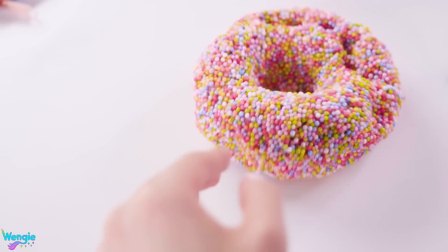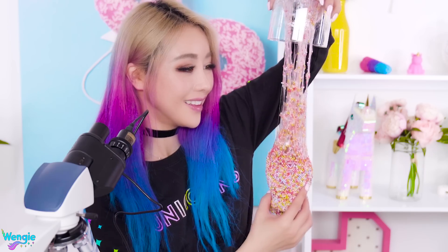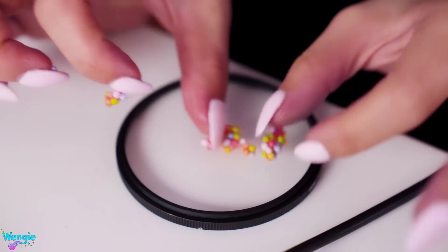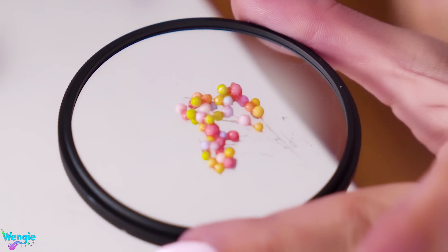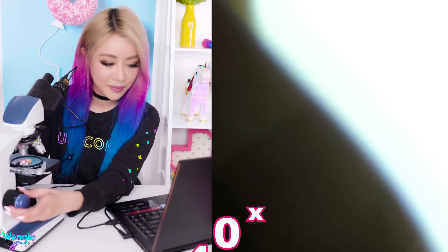Next up is floam slime — again from adding too many ingredients into slime. Let's poke it. It's literally super solid, it's like a donut. I'm so excited for this one. I'm going to try and get one of these stringy things onto my slide because it's going to look amazing. Finally got it onto the slide. I tried to get as many stringy things between the floam balls as I could. We're starting, of course, in 40x zoom.